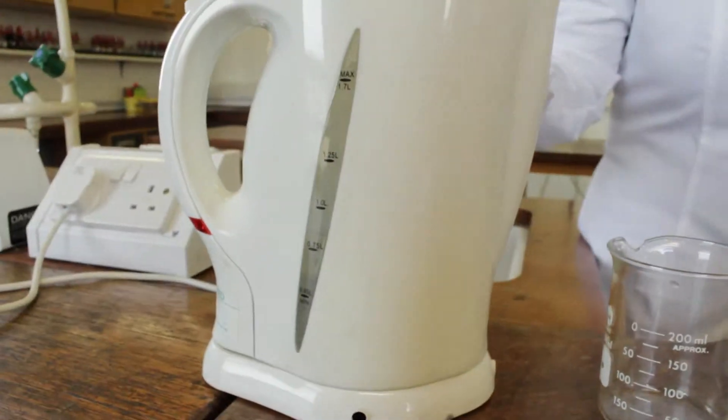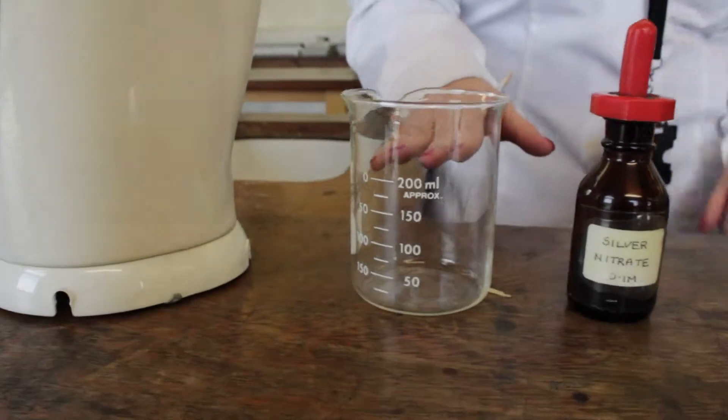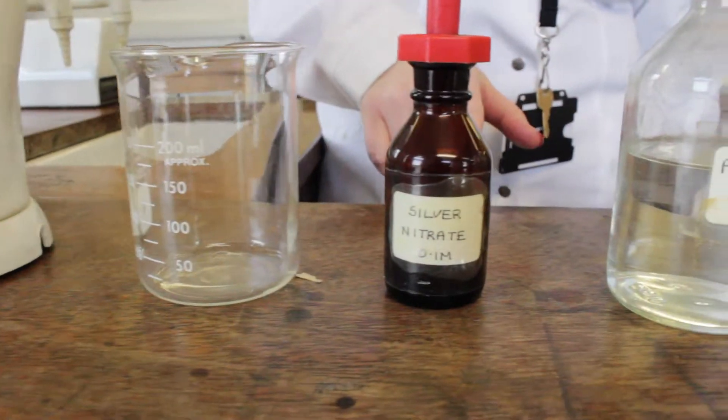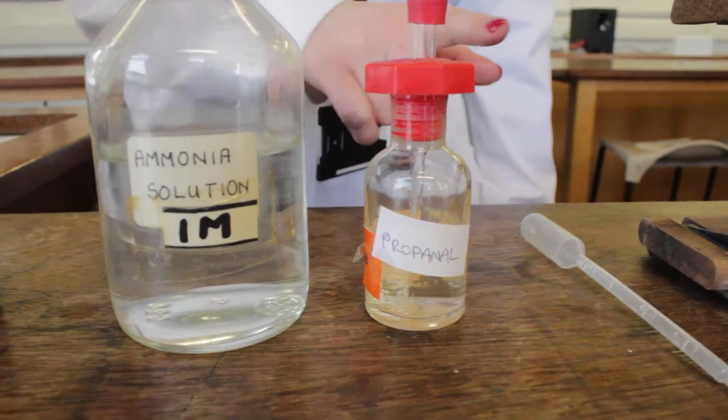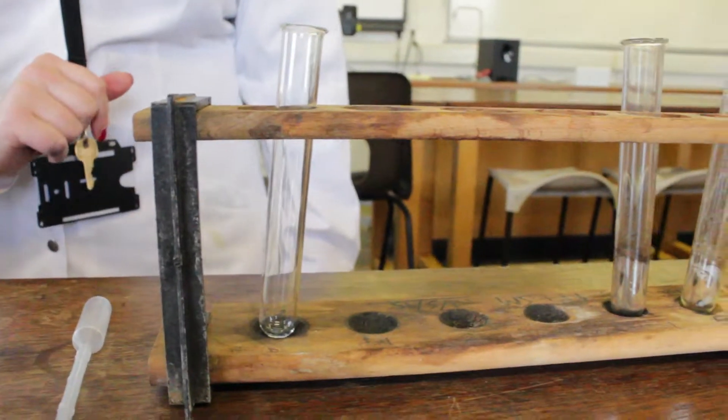We have some hot water, a beaker, silver nitrate solution, ammonia, propanal, a pipette and a clean test tube.